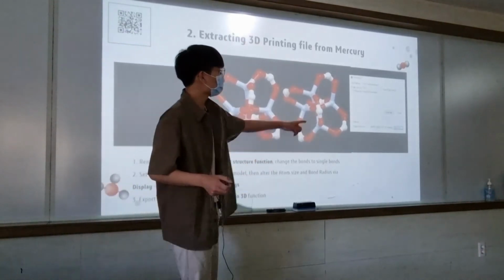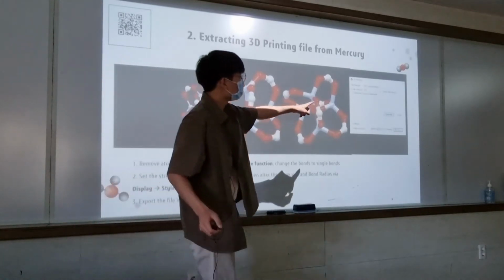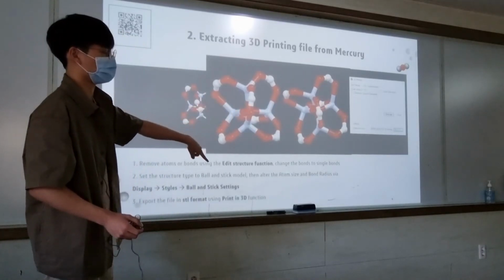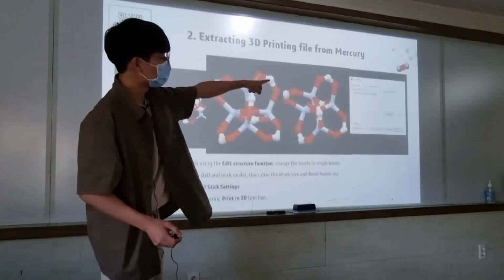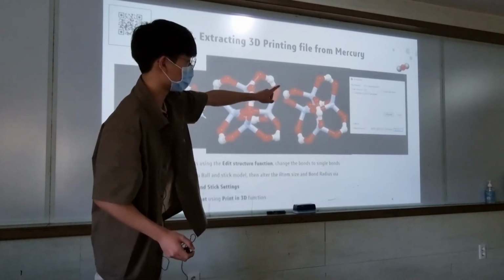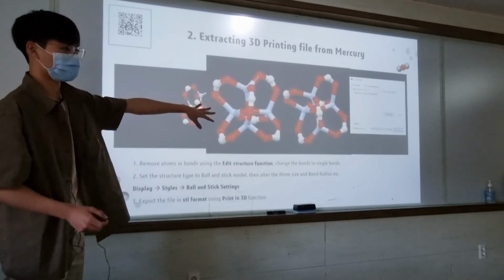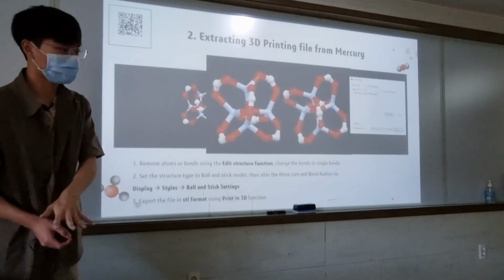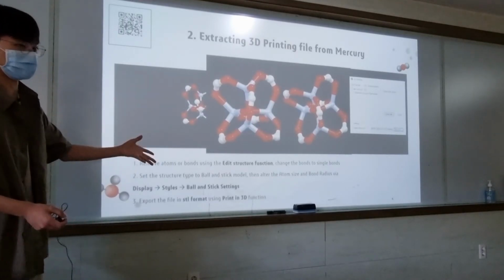And when you go to the Print in 3D function, there are two types, STL monochrome, and another color tone version, but it doesn't work with our school's 3D printer. So I recommend using the STL file format. And when you generate the files and click the output directory and click browse, in some computers this doesn't work, so they need to use other students' STL files. In my case, my computer doesn't work when I do this, so I had to use another friend's STL output file.